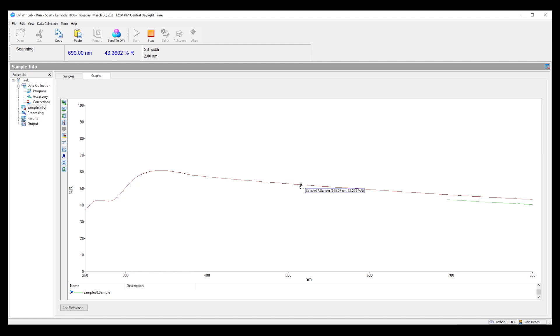As you can see the diffuse reflectance is about 5% lower than the total, meaning that the specular reflectance component is about 5%.